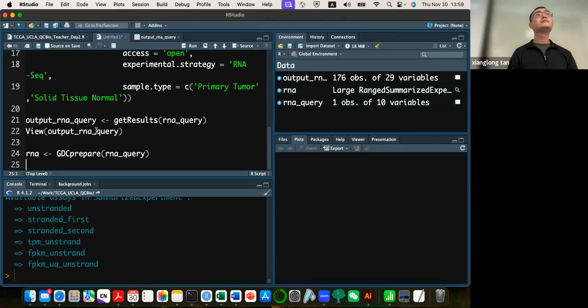You're saying you can make a folder, for example, for the GDC data, then make the working directory the same folder so that it can easily access those files. Yes, so that's why we set up the same working directory as yesterday.